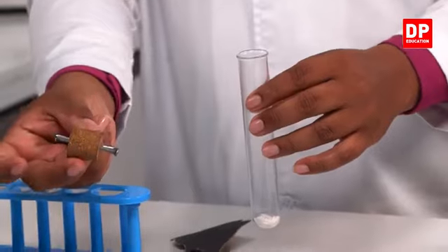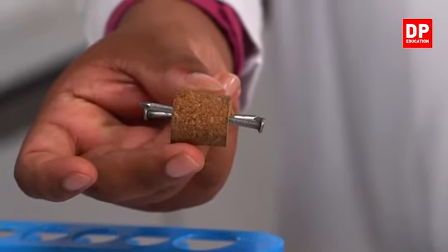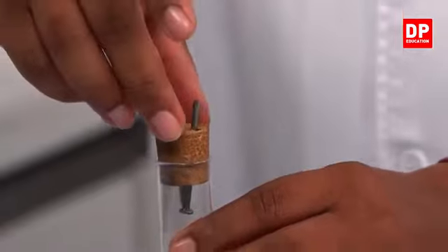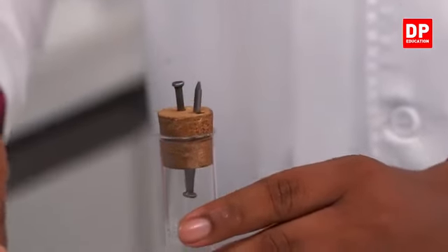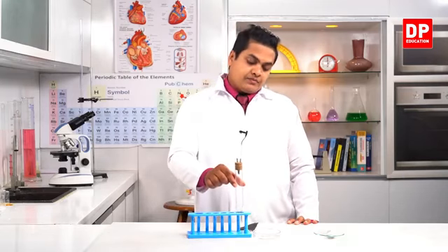See, cleaned iron nails. Now I'm going to stopper it using this cork. So I'll insert it here and insert it very well like this. Okay children, now this is our setup.